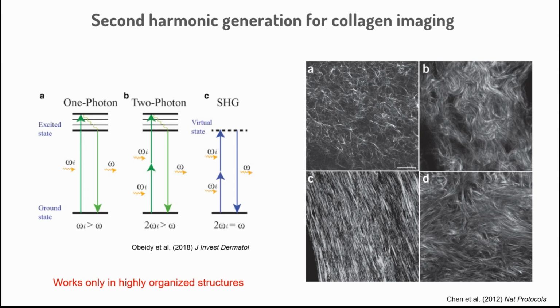Here there's no absorption, so you are not giving energy to the system, because you will recover all the energy. And the energy will be exactly double that of the incident photon. In two-photon fluorescence it is not the same. You cannot sum it, and this number is very variable. It depends on the fluorophore, because it depends how much it will decay, and this changes for every fluorophore. So two-photon absorption is completely different to this one, and this one only happens, as I told you, in very organized structures that will generate this reverberation of the wave.